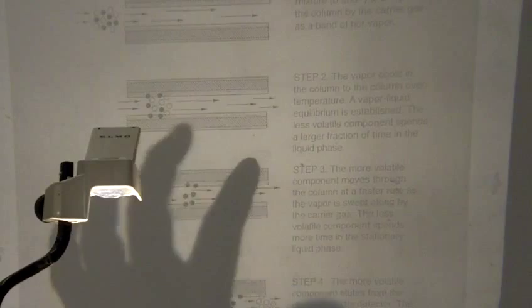And so then, once they're separated, we can determine what the components are using standards, and we can calculate how much of each component there is.